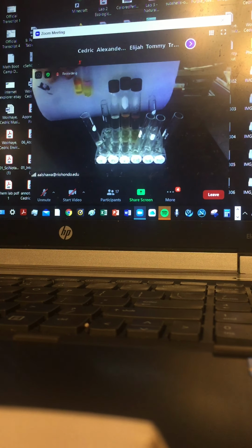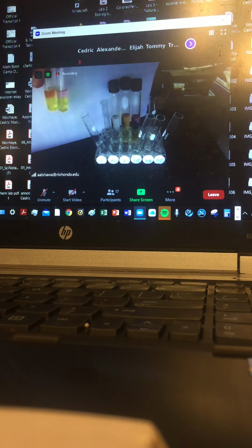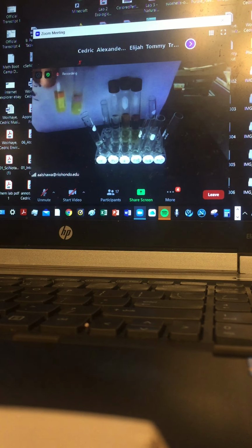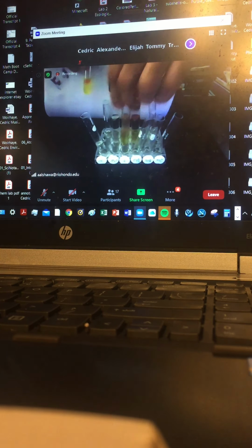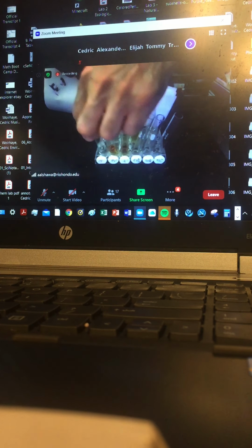So the rusty orange is the outcome of the bromine. They are molecules in the organic layer. The pinkish background, which is attached to the right-hand side, is the outcome of iodine. So iodide, I negative, turns into I2, iodine. So this is iodine in the hexane layer, and this is bromine in the organic layer. Bromine, iodine, based on the color of the organic. The organic layer, in the case of chlorine, is clear.